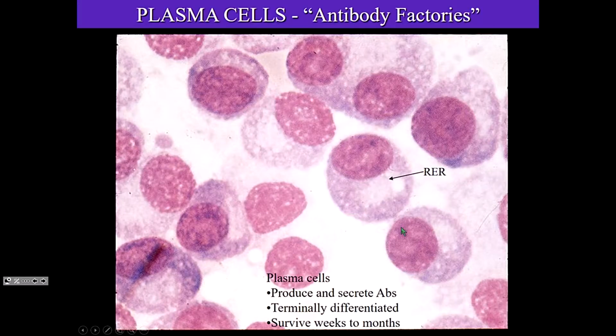Okay. So once these B cells become activated, they become plasma cells, okay? And you remember a plasma cell, we know from the connective tissue lecture, the different cellular components of connective tissue. We recognize plasma cells because they have an eccentric nucleus, i.e. off-center. Sometimes we can see heterochromatic arrangement of chromatin looking like a cartwheel arrangement, but not in this one.